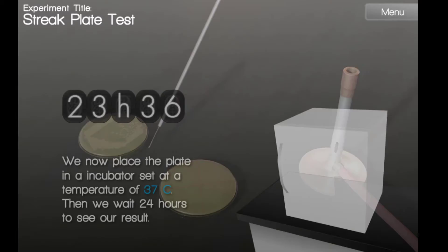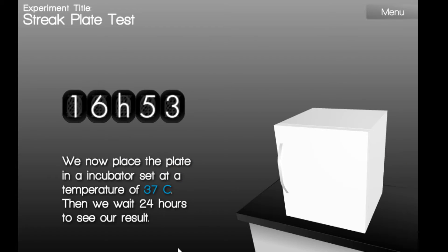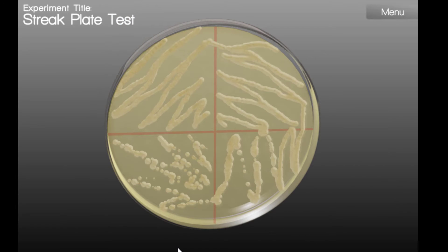Now we're going to place the agar plate into an incubator. The fourth quadrant is usually where you will find the isolated colonies. This is because with each successive quadrant, the inoculum was further diluted.